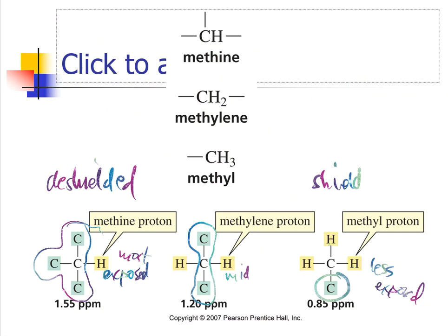So in this very first example, we see hydrogen here, but the very first rule was all about electronegativity, basically electron clouds being sucked through. That is not what these are. There's no electronegative group on these compounds at all. It's all about the number of hydrogens. So the lower number of hydrogens, the more downfield this signal will be. This particular carbon has one hydrogen only, so this one's a little bit more exposed.